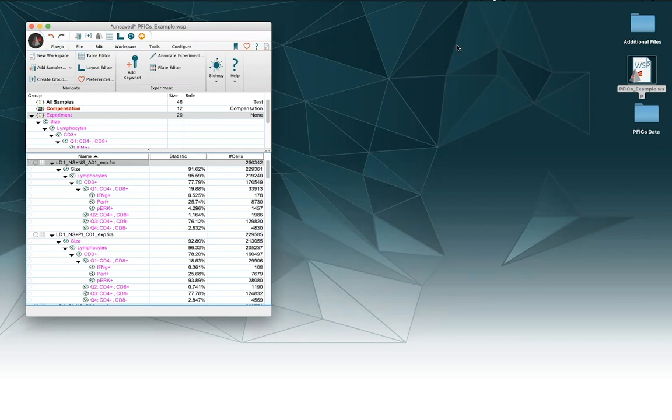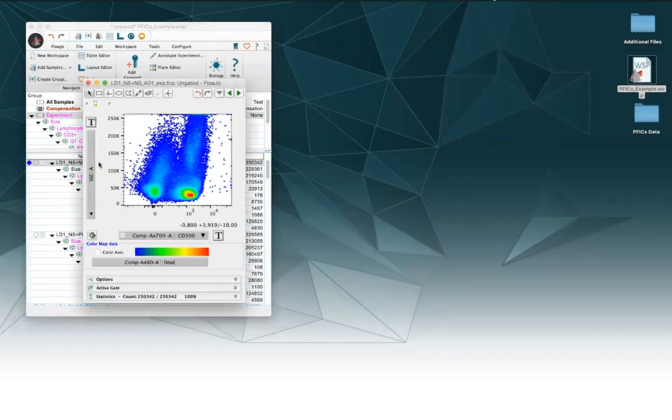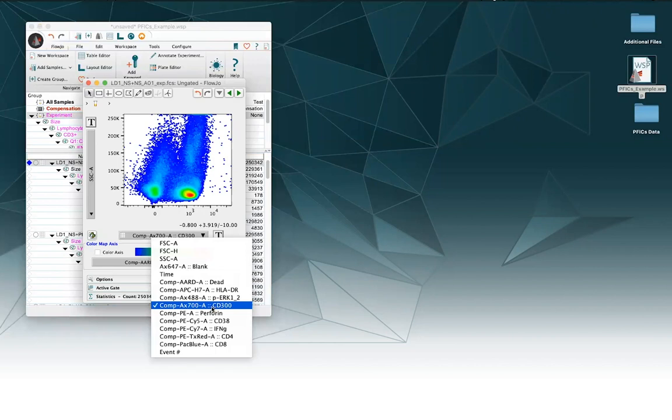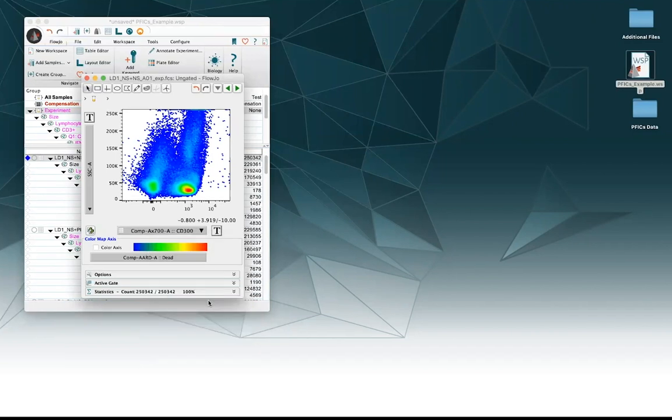We were going too fast when we were acquiring it, accidentally named something wrong, now we don't like it. For instance, here in FlowJo, I see that this parameter here is CD300. That probably doesn't make sense. I really wanted this to be CD3 but I accidentally hit the zero twice.